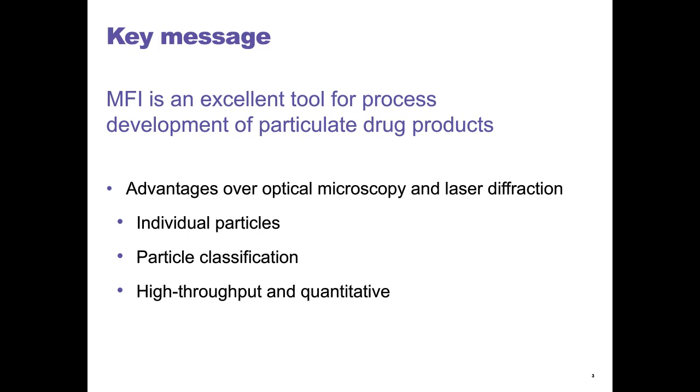This enables us to distinguish different particle populations and quantify these populations. Moreover, it is a high throughput technique, particularly when using the BOT1 autosampler like we do in our company. Hopefully, I will make all of those points clear in the next 20 minutes of this webinar.